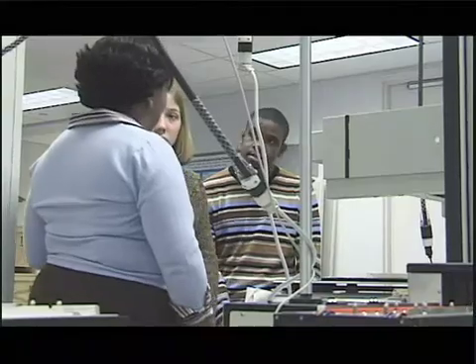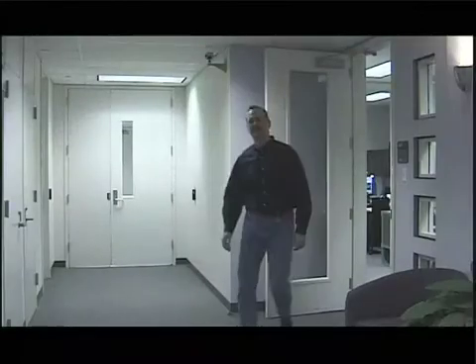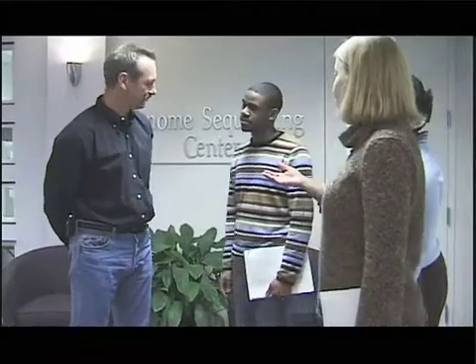So, now we're ready to go to sequencing. Hey Andrea, another tour? Yes, this is Libby and Bryson. They're two Washington University students, and they're interested in our work here at the Genome Center. This is Dr. Rick Wilson. He's our center's director.